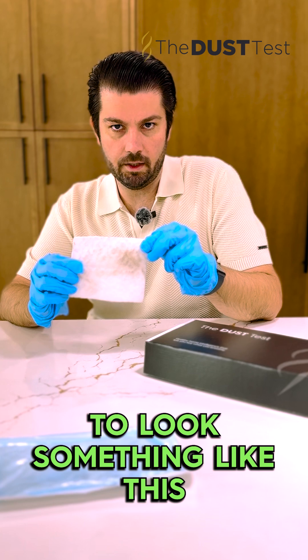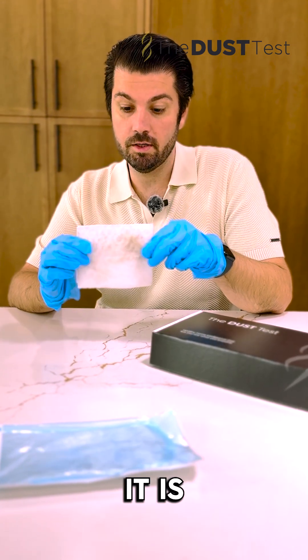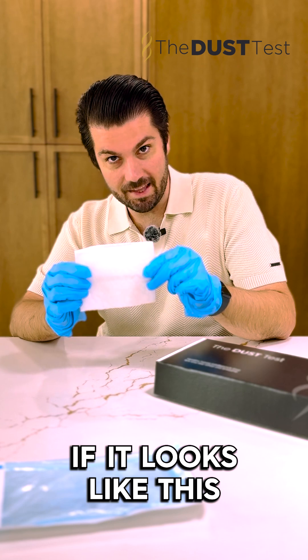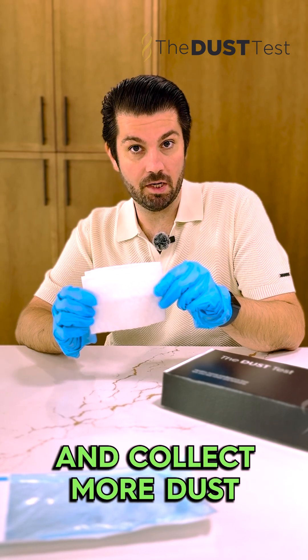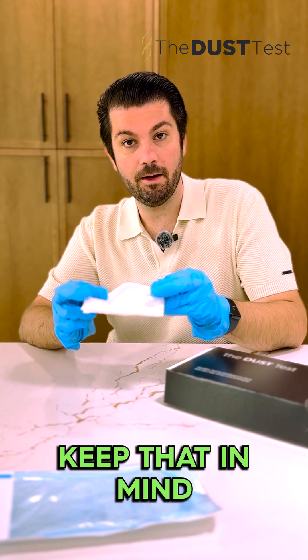You want your cloth to look something like this. You need about five milligrams of dust — it's not a lot of dust. Just make sure you see some evidence of dust on this cloth; this is the side we collected dust from. In comparison, if it looks like this and you literally see no dust on it, you're probably gonna want to wait a little bit and collect more dust, because you need to have some level of dust to be able to analyze. Keep that in mind.